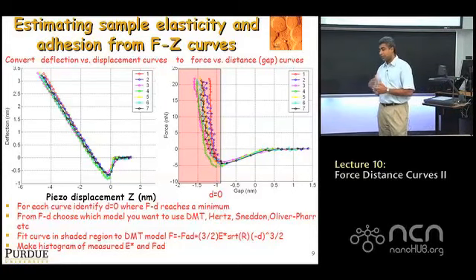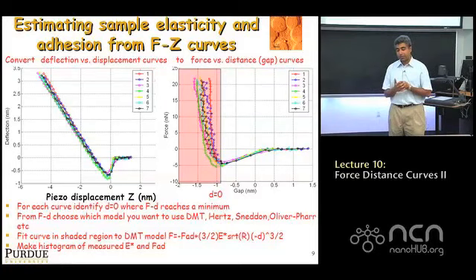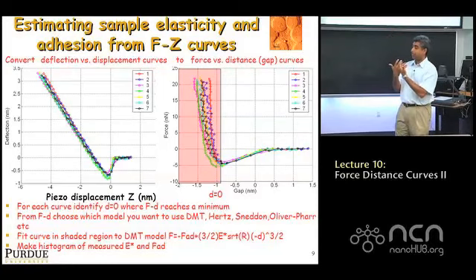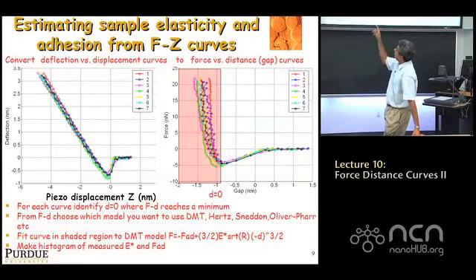So there's a lot of interest, for example, in probing the elastic properties of the material, the epoxy that holds these fibers together. One way to do this is the AFM, because if you look at the gaps between the carbon fibers, they range from a few nanometers when the fibers are very close together to a few microns. What is expected is that the polymer or epoxy properties ought to change in these small regions in between the fibers due to two effects.